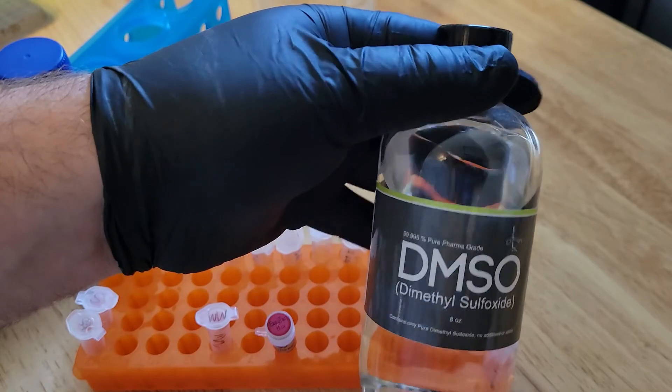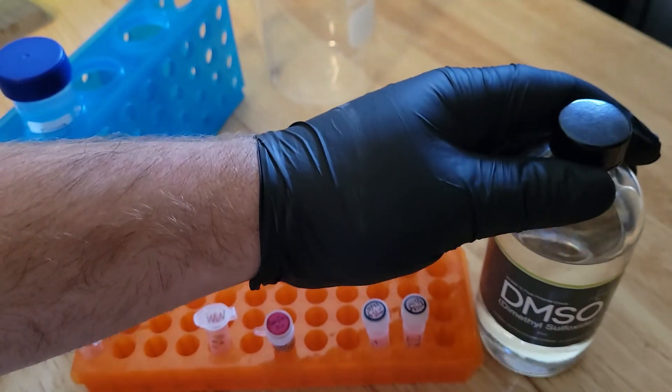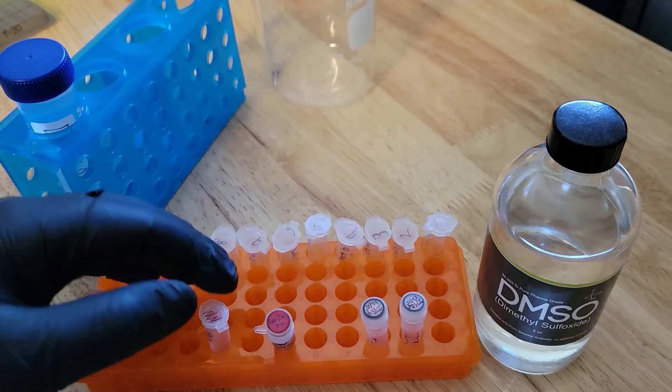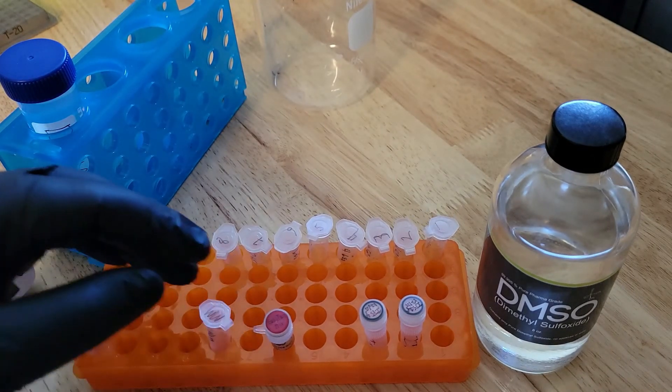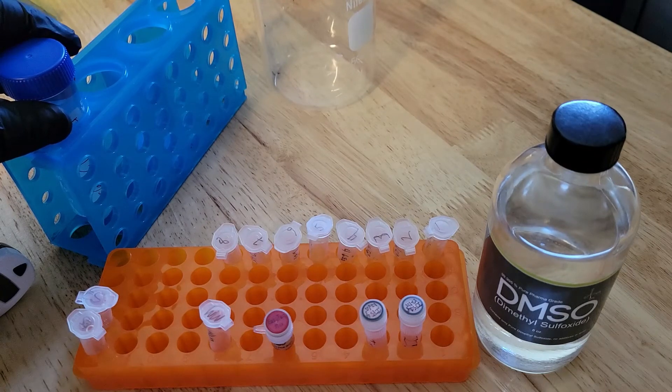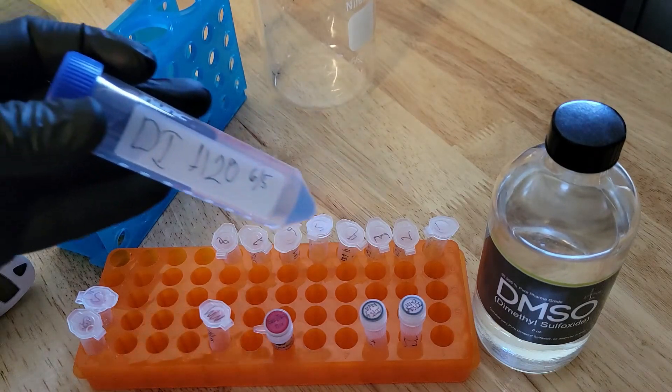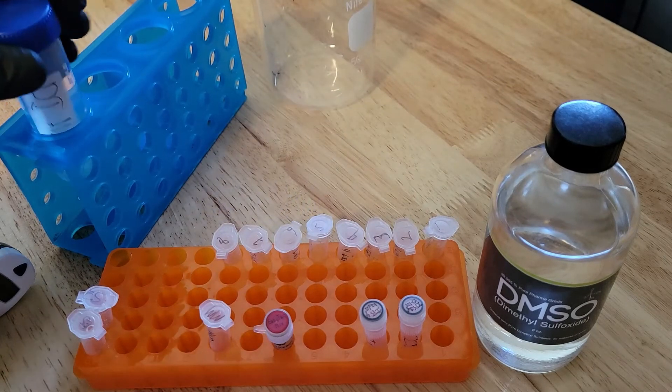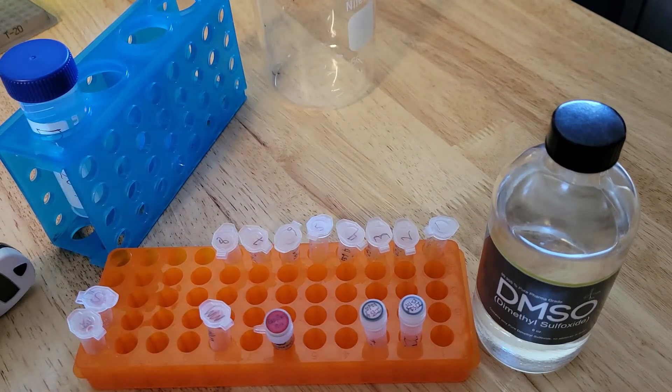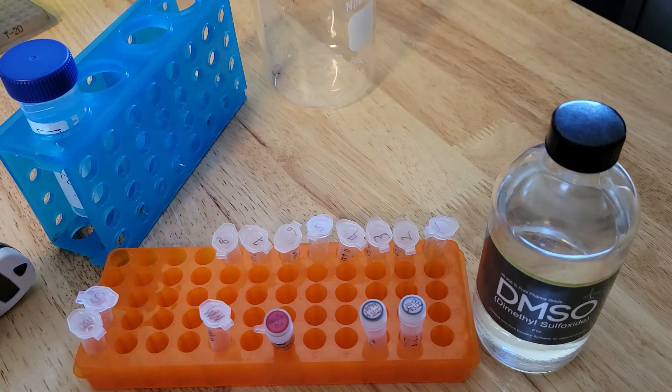ITS1F forward primer. We put very, very small amounts of that in there. A tiny amount. This is dimethyl sulfoxide, DMSO. I put a little bit of that in there. I got that from eBay. It was not hard to come by. That helps with the melting of the primers. Then I've got deionized water. That's just going to round everything out. Those will be the ingredients in the PCR master mix.